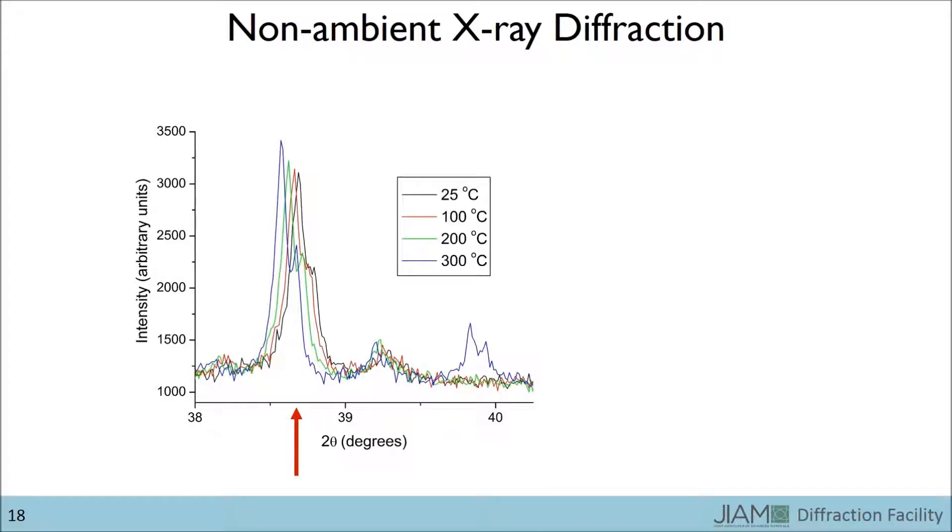Looking at the peaks around 38.7 degrees 2 theta, we can see that as the temperature increases, the position of the peak shifts to lower 2 theta, indicating an expansion of the lattice parameters.